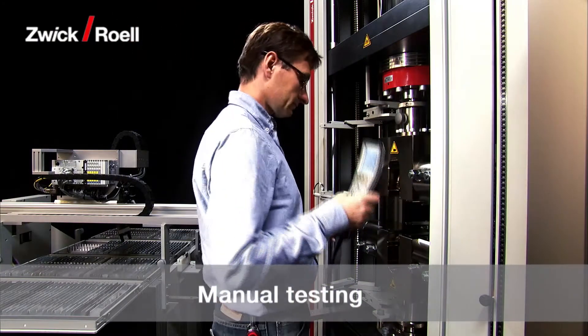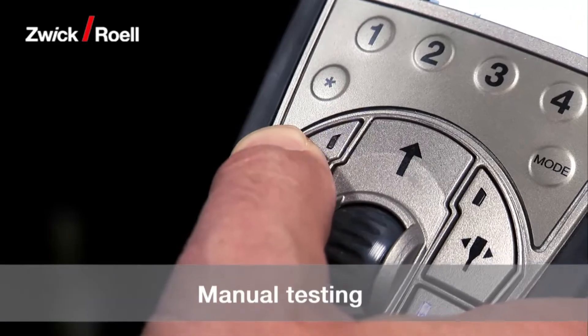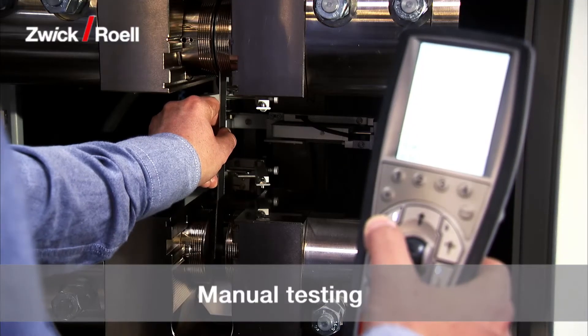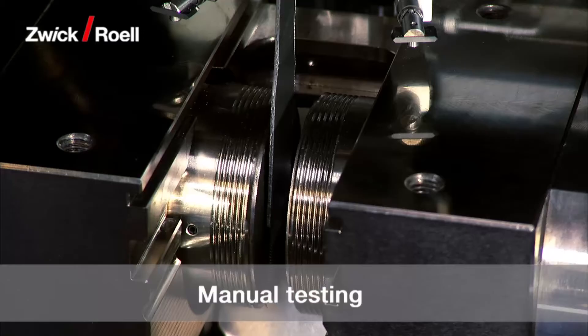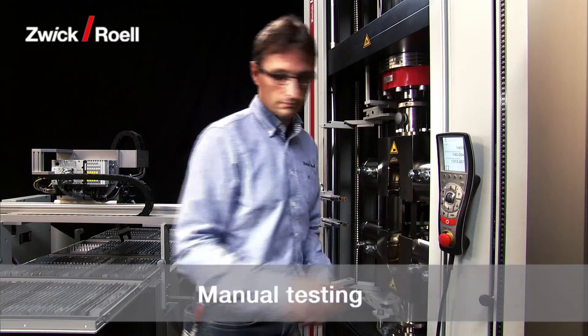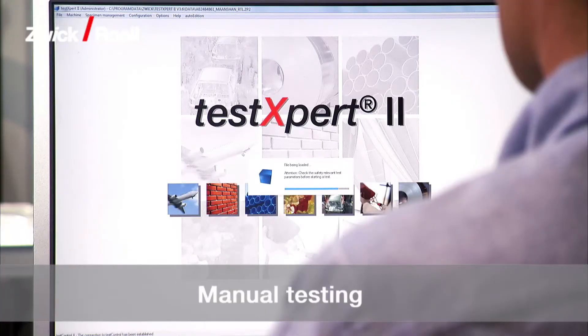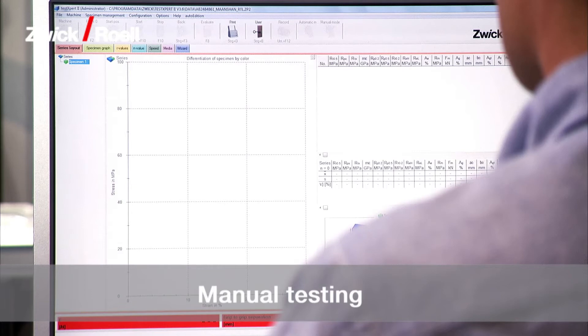The automatic testing system shown here allows manual testing whenever required. The automated unit is swung aside to provide optimum access to the test area from the front. The testXpert testing software is used for both manual and automatic operation. No additional familiarization is required.